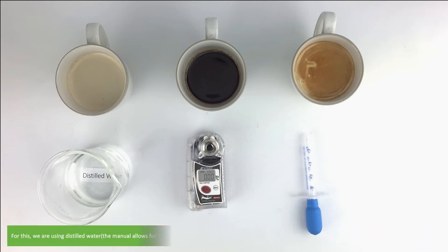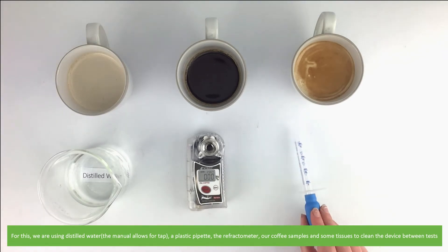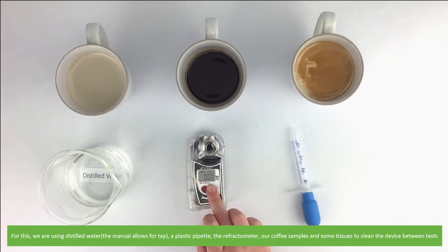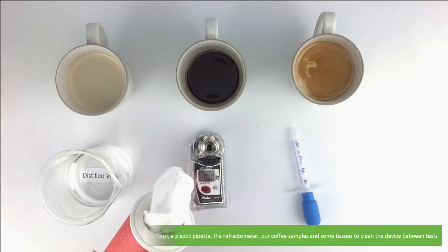For this we are using distilled water — the manual allows for tap — a plastic pipette, the refractometer, our coffee samples, and some tissues to clean the device between tests.